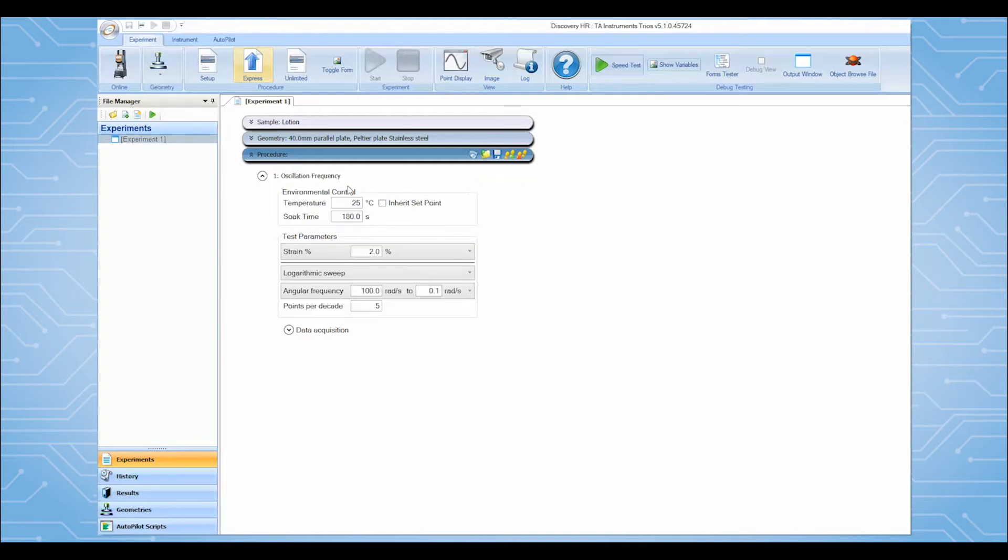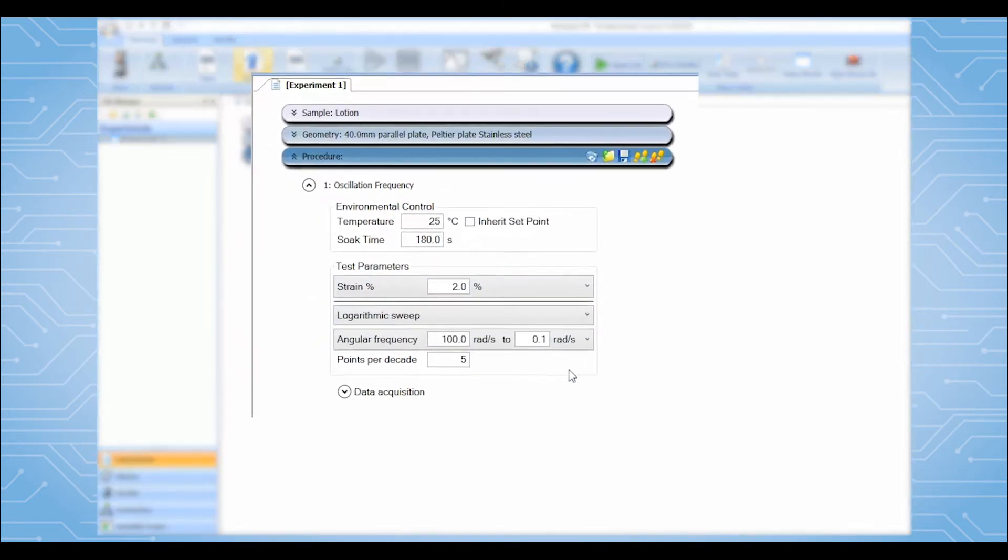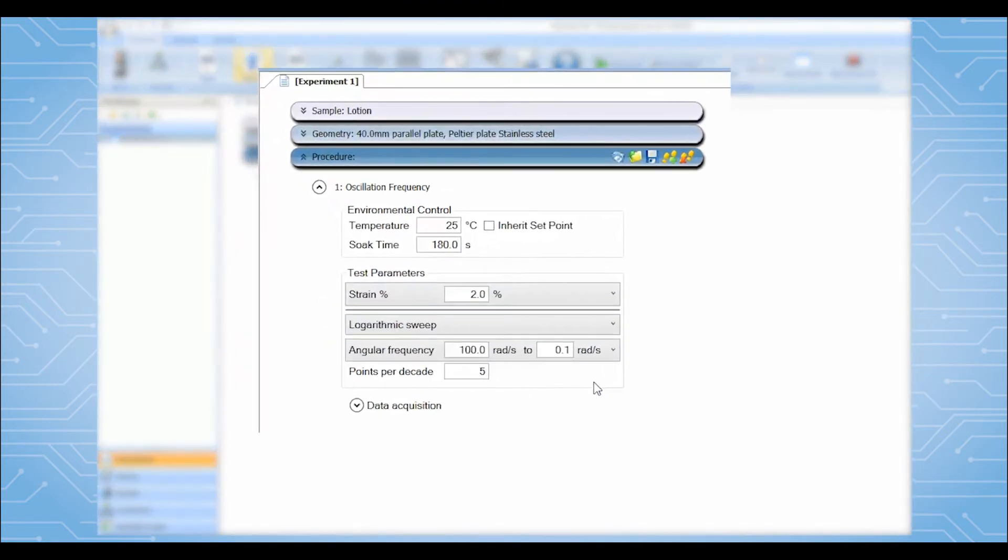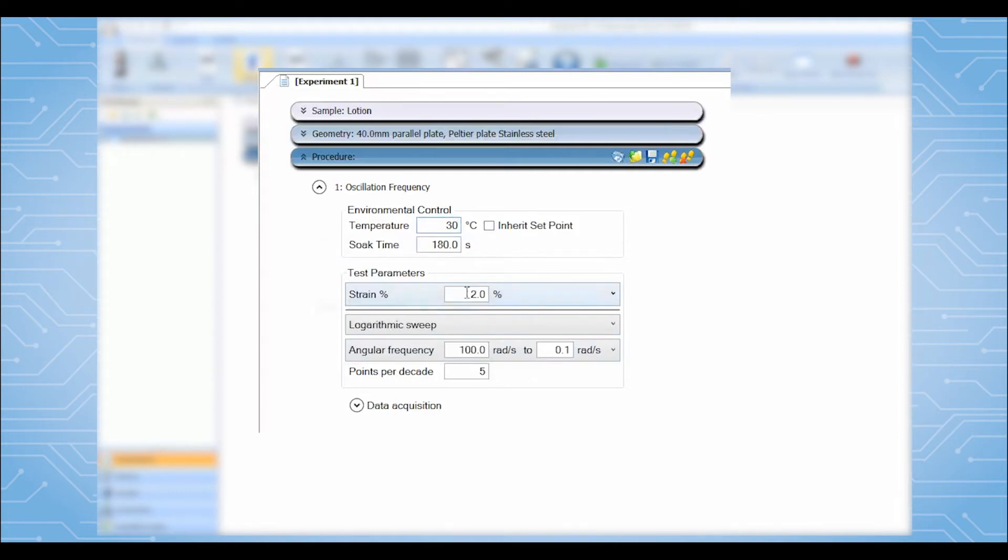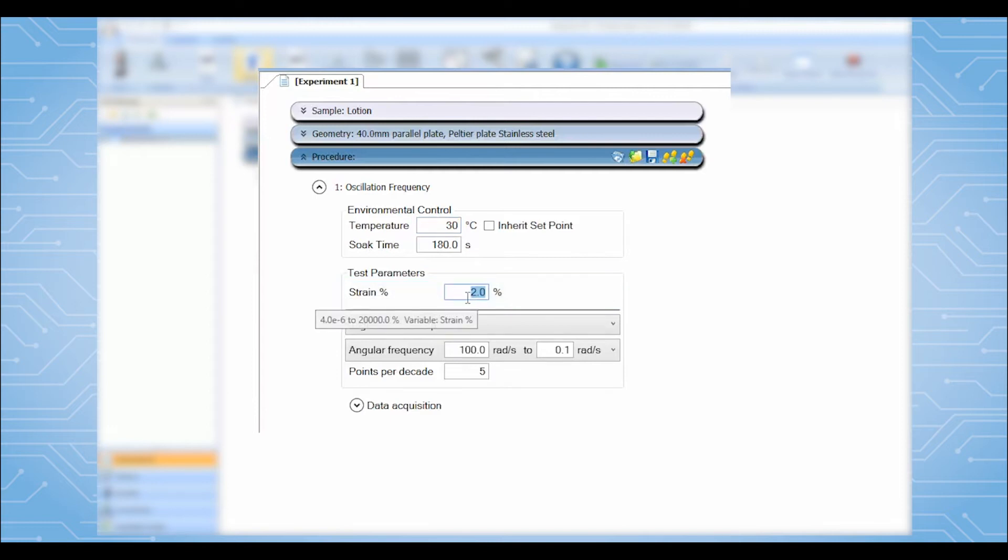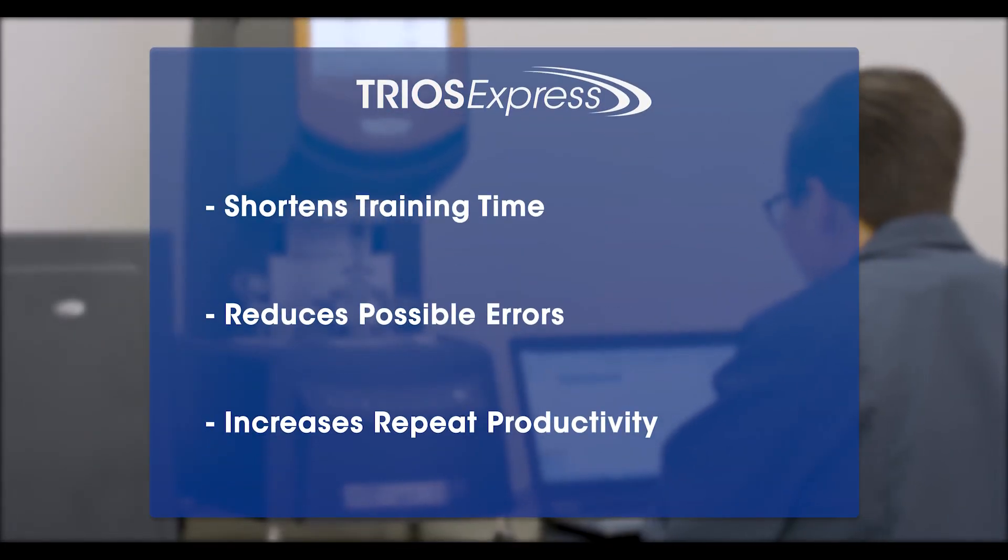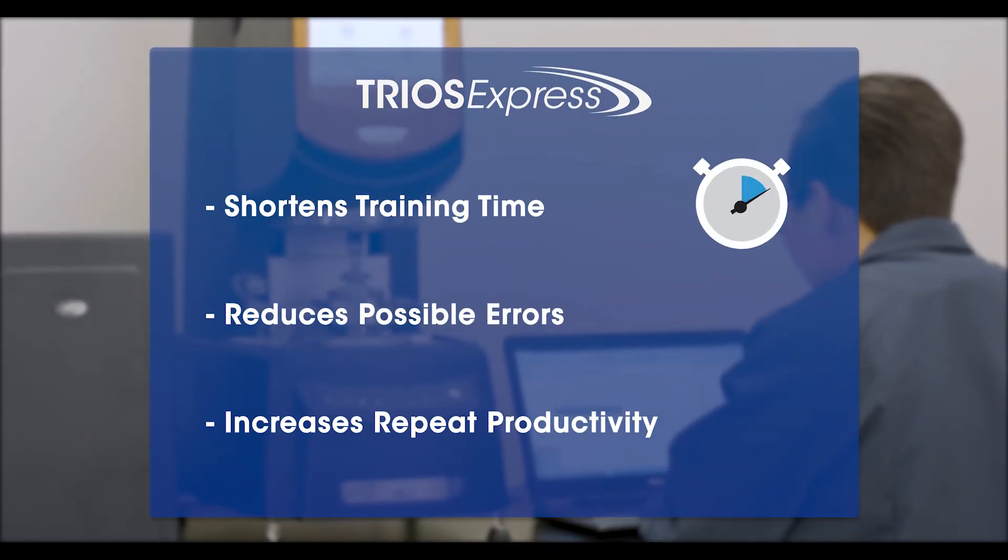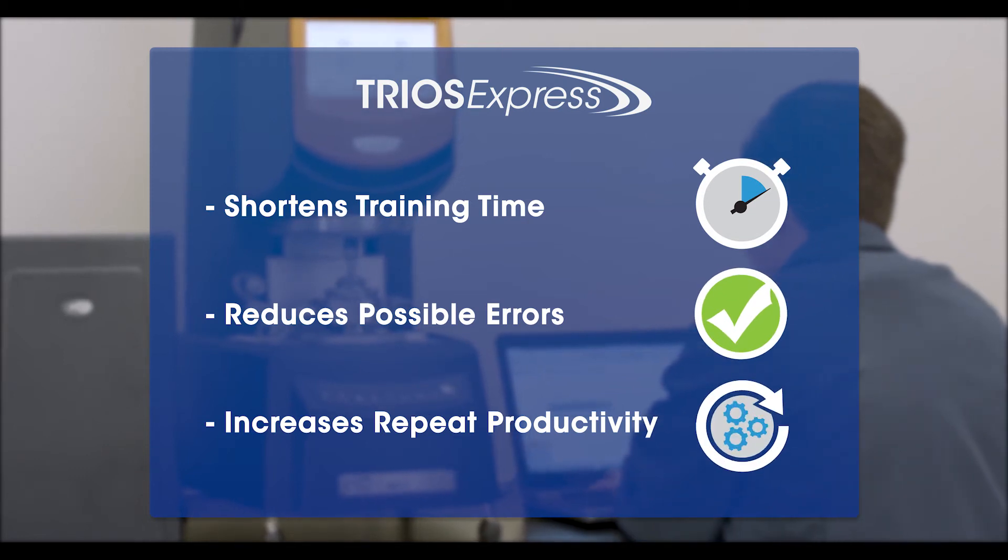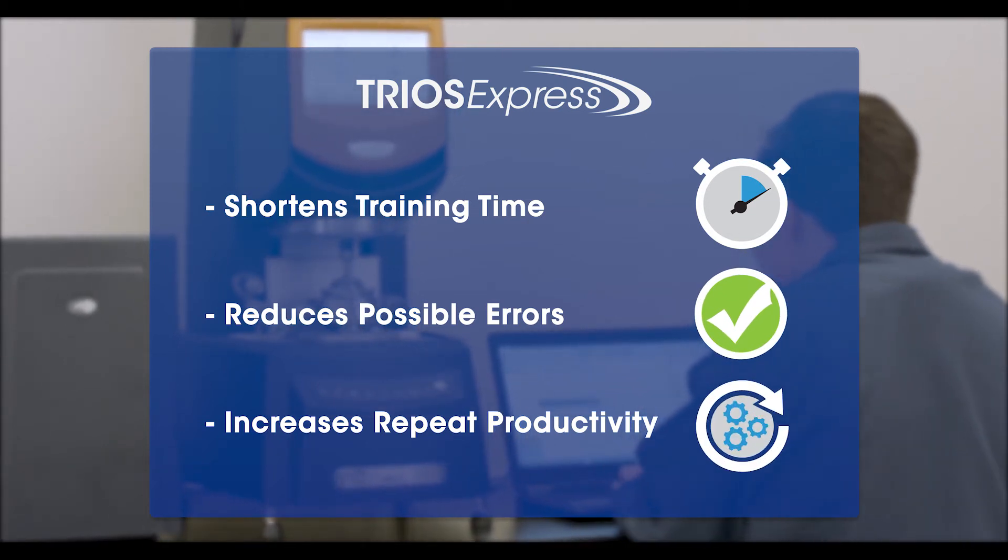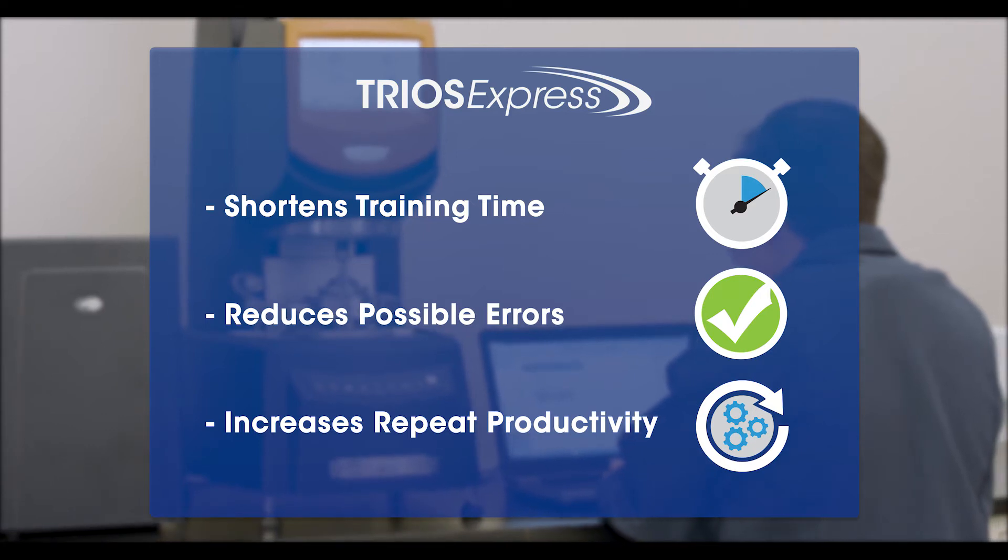Selecting TRIO's Express mode will present test setup details in easy-to-choose self-contained forms. All necessary testing parameters will be populated with sensible default starting parameters. For routine use and common test types, TRIO's Express mode shortens training time and reduces the possibility for making mistakes in experimental setup.